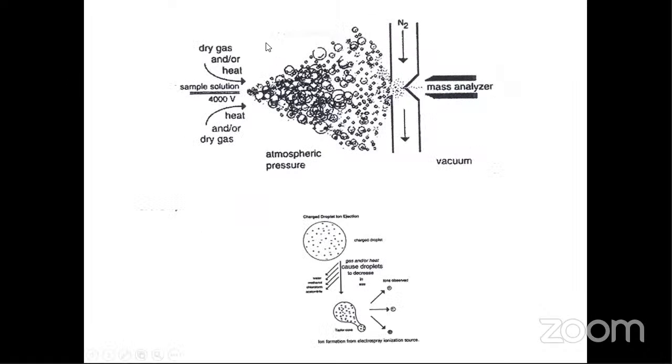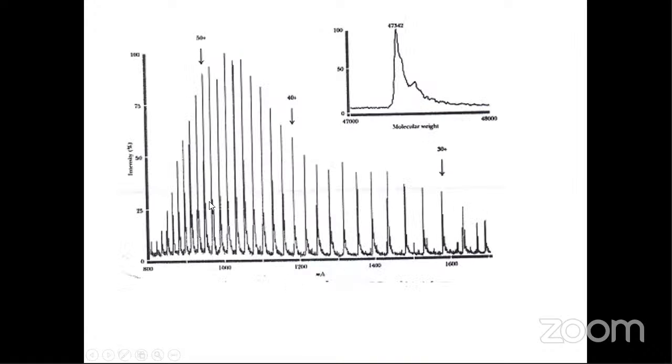Okay, so you are sending the sample in with high charge, and then the solvent gets evaporated, and then finally the sample goes into the mass analyzer. That's the technique. So the solvent gets removed, you are applying almost 4000 volts, so the sample gets highly charged. Like I said, it can acquire one positive charge, two, three, four, and so on actually. So in a typical ESI, you may get such a nice spectrum, corresponding to each one of them.